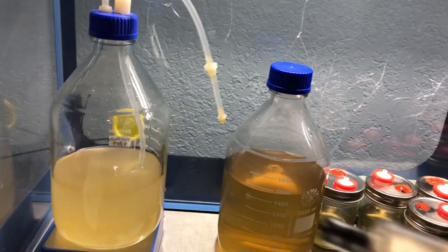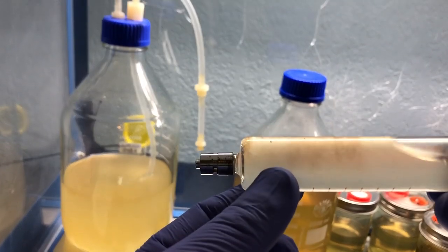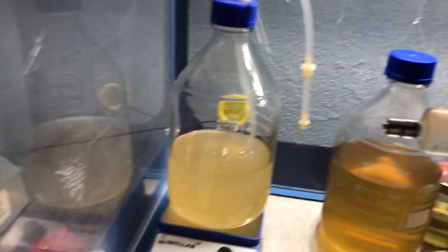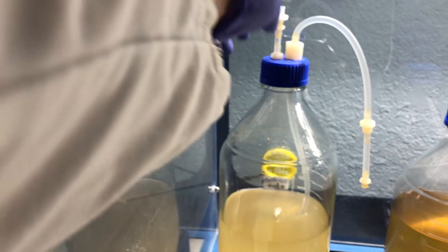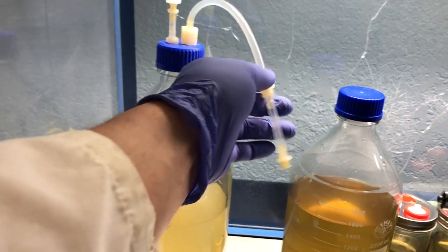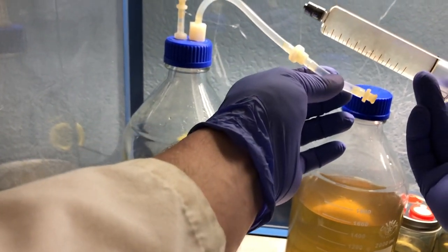So you can see all of that healthy mycelium right there. There's a little bit of air that you could push out, but that all came from there. And if you look at the setup, there's a 0.2 micron pipe filter right here, and that filters the air as it's drawn in through the top. And then there's a backflow preventer here, so that this area is the priming area for the extraction.